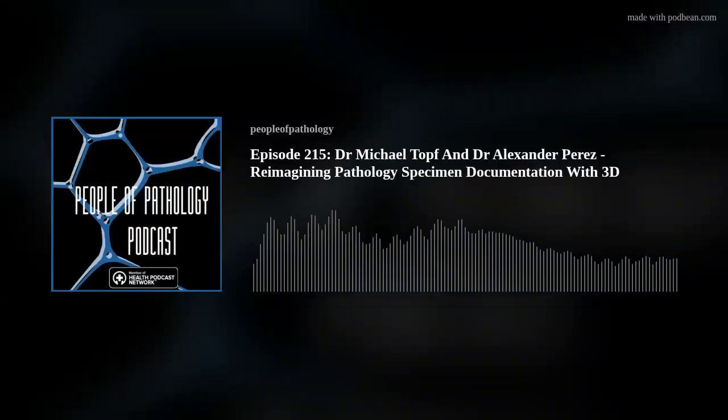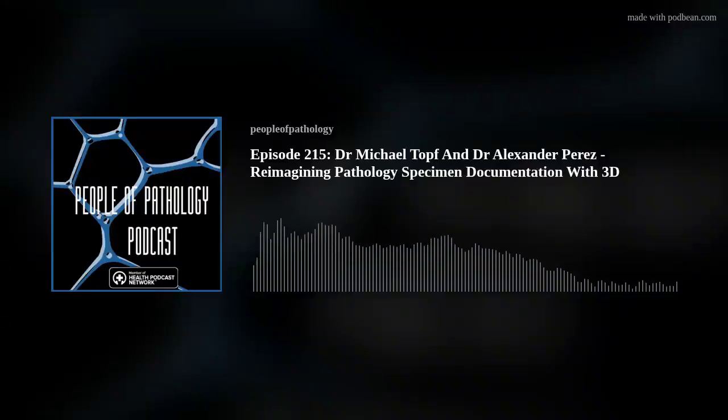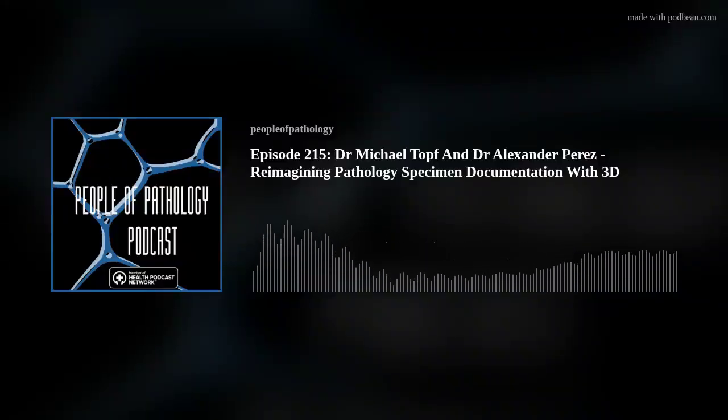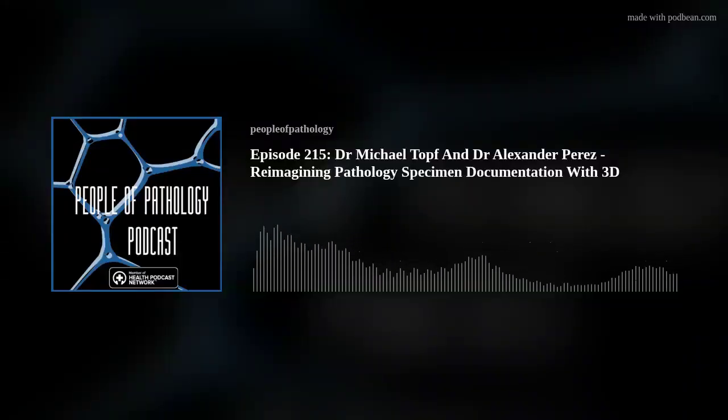As Mike mentioned, the early rendition of this was just a person using a room we had in our former lab. We've since moved all our pathology operations to an offsite lab. But at the time, we were right next to the OR, and we had pretty limited space already for the gross room. And then there was an even tinier room that had the bone saw, and you had all the flammable material storage in this teeny tiny room. So if someone was having to use the saw for any reason, it was very disruptive if you had a person with the door shut trying to scan specimens for 10 minutes at a time.